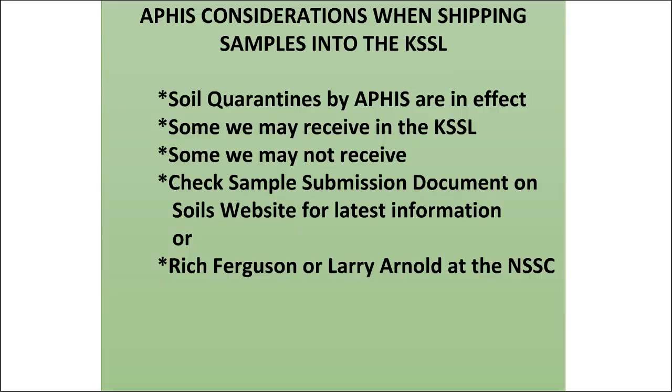Okay, I'm Larry Arnold, and I want to give you some other considerations about the samples before you send them in. And the big one that we're going to talk about is APHIS and Nebraska Department of Agriculture. They do have some restrictions on soil samples that come from certain parts of the country that are quarantined by those two government agencies. And so we've made it easy for you guys out in the field as far as how to know if you have, well, you don't really need to know unless there's samples that we cannot receive. But it's also good to know if you do have quarantine soils, there are some that we can receive and some that we can't. But the most important one that you need to know are the ones that we cannot receive.